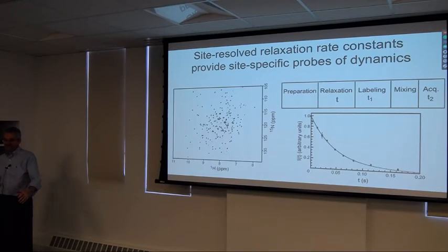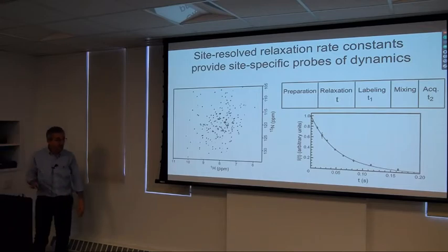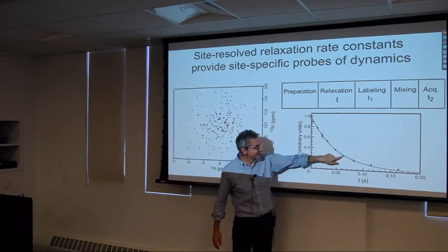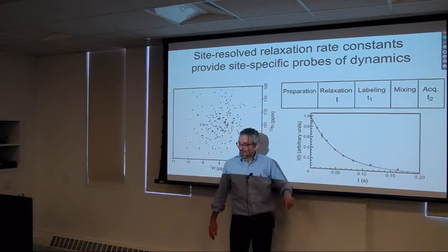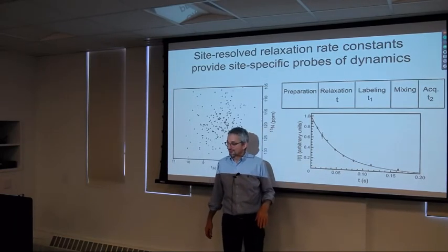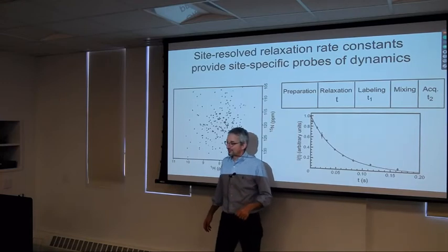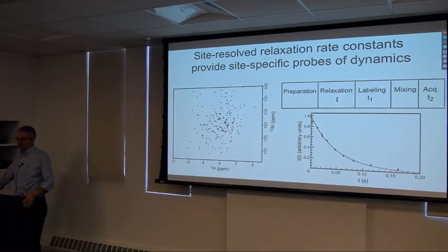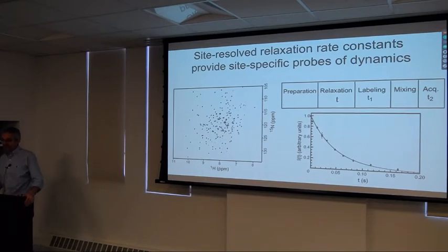So the room temperature could change so substantially during one of these experiments. And then you would see substantial scatter of these points away from the fitted curve, depending on how out of tune the probe got. So we now monitor the room temperature, and if the room temperature has gone crazy during an experiment, we just throw that data away and recollect it, unfortunately.